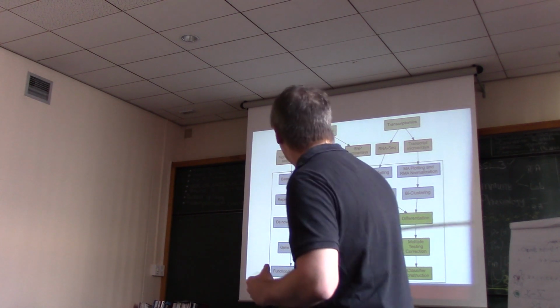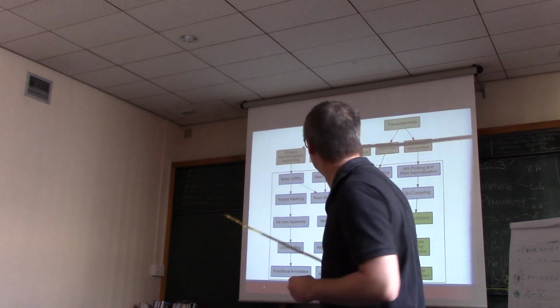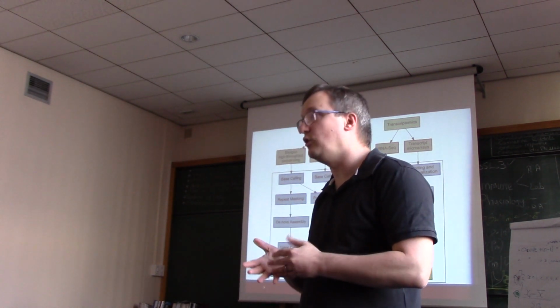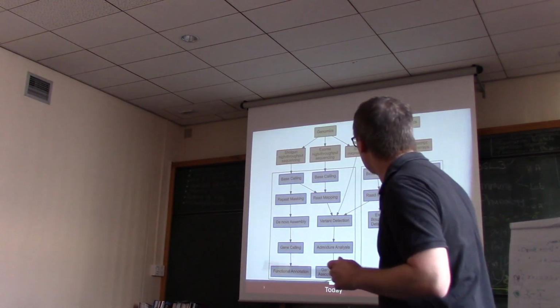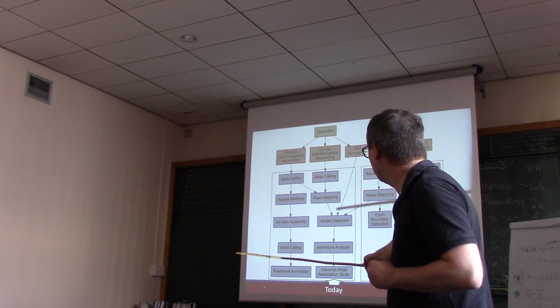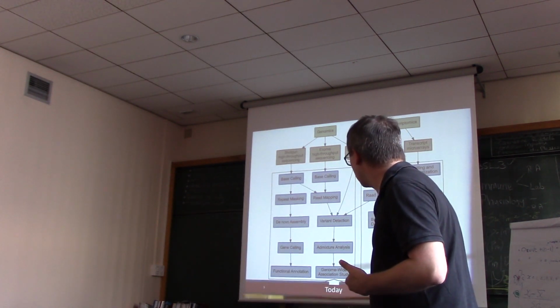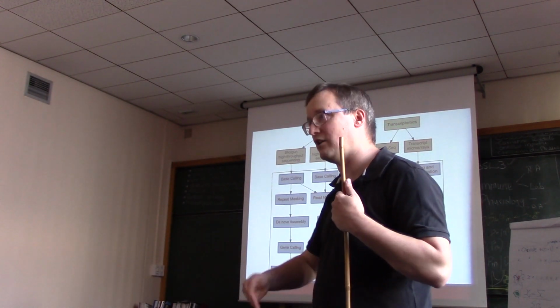for example, in populations. So you don't have to have a sequencer for some of these things we're talking about to be relevant. And of course, once you get to transcriptome, once you're talking about things like gene expression, you're probably dealing with microarray data or with RNA-seq. We'll talk about that in some depth on Wednesday. But today, the track that we're really focused on is this process of base calling, read mapping, variant detection, and phenotype assessment, which variants actually matter, along with things like admixture and genome-wide association studies. So that's kind of the roadmap for where we're going to go, just straight down that column today.